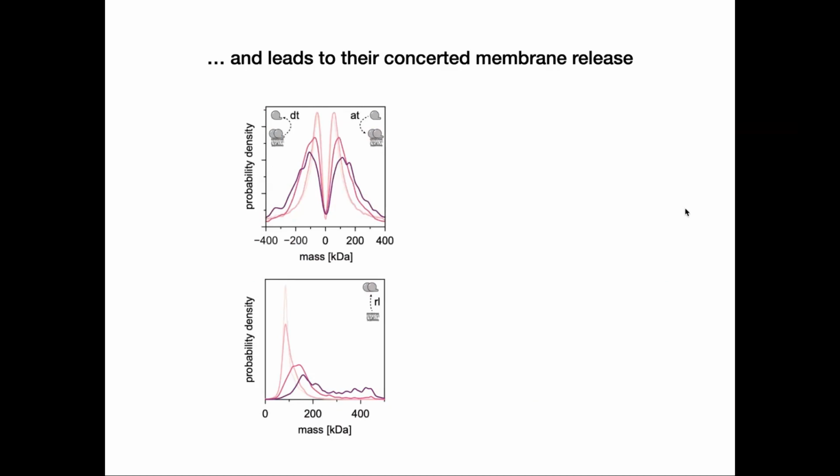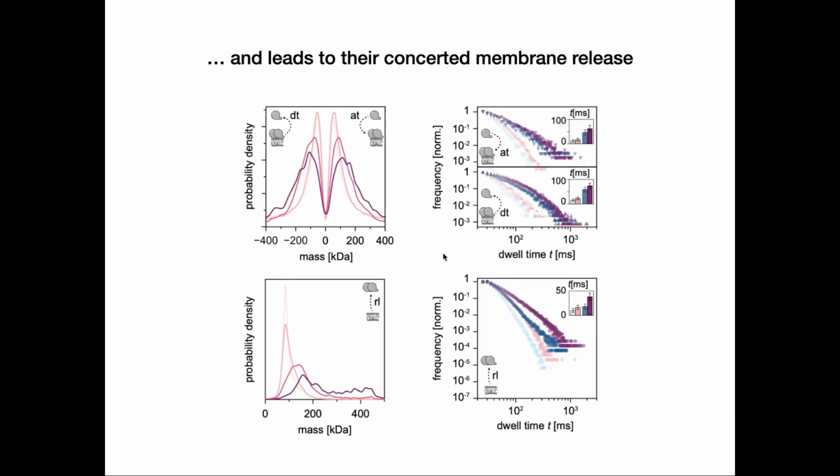And if we also apply our time-resolved analysis to the traces of MinDE, you can see again that the higher the protein density on the membrane gets, the larger objects actually attach and detach to our complexes, and the complexes that are being released from the membrane are getting really, really large, up to something corresponding to MinD 8-mers or 10-mers as the protein density on the bilayer is high.